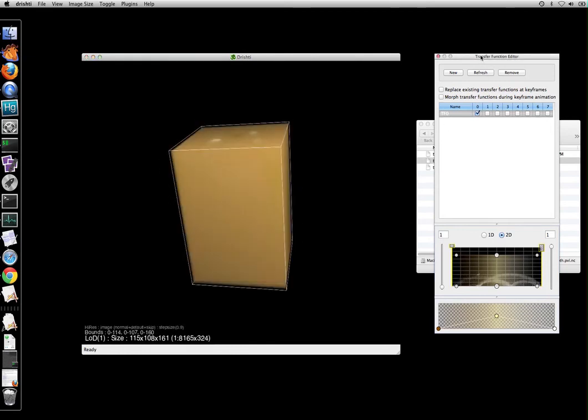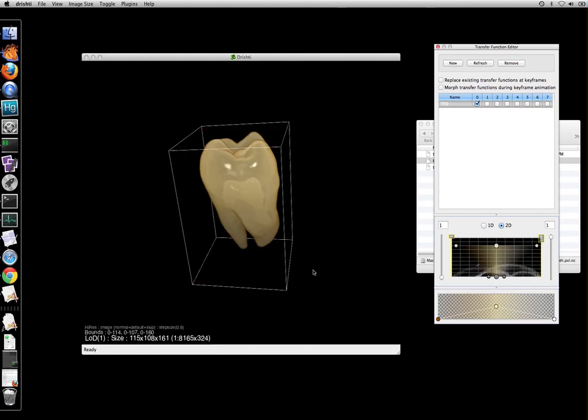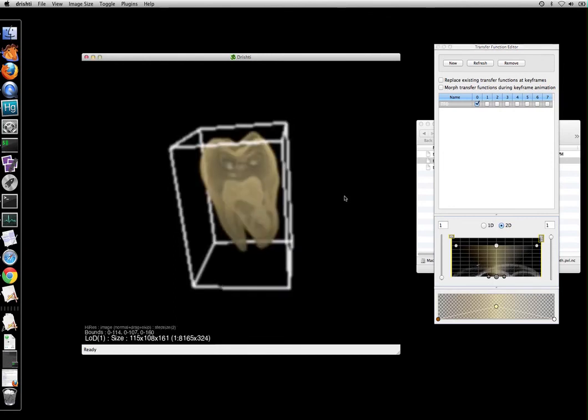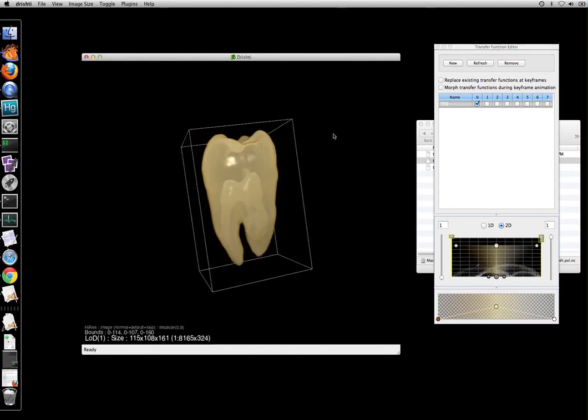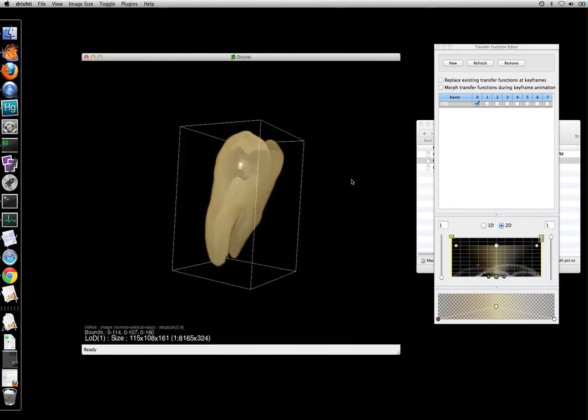Let us change the transfer function. And using shift key and then left mouse button to change that. And this is our volume.